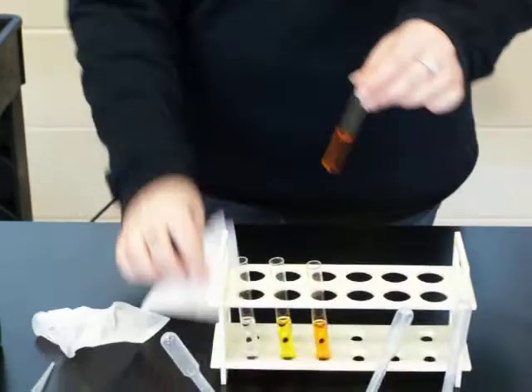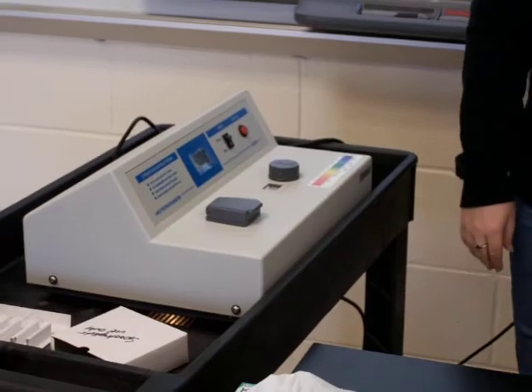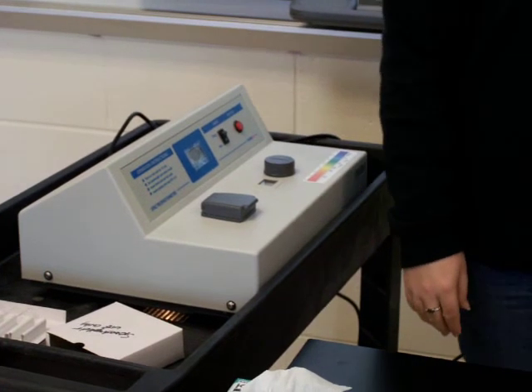And now sample C. And sample C has an absorbance of 0.77.